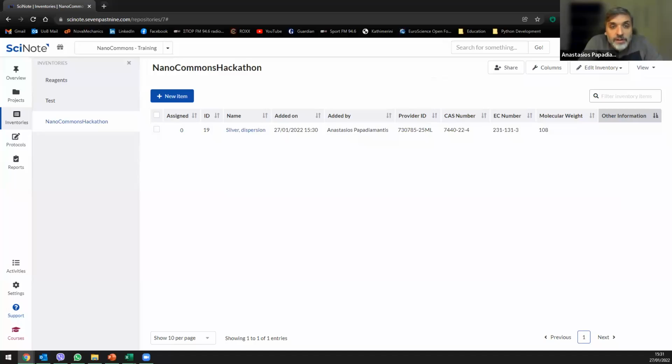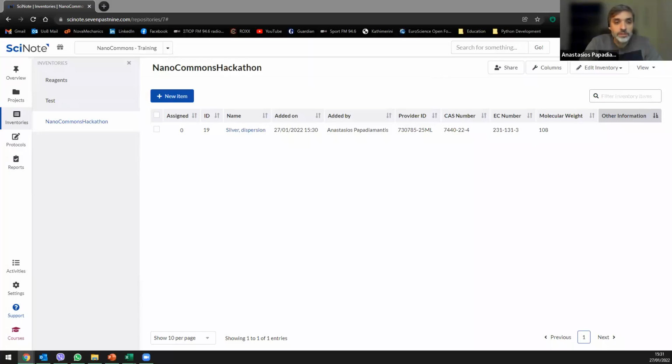This is the file number 2, which is called the silver dispersion, etc. Give me a second, please, because I did not download it.